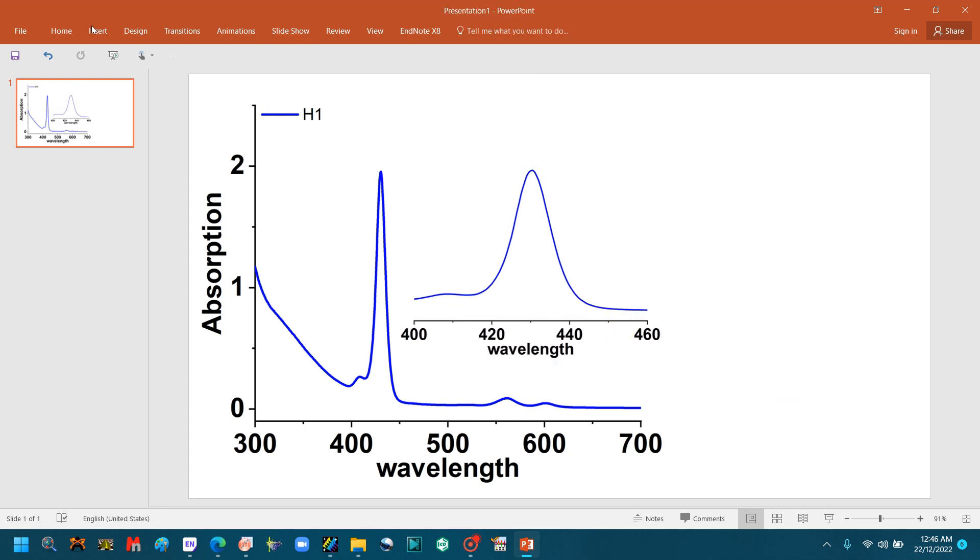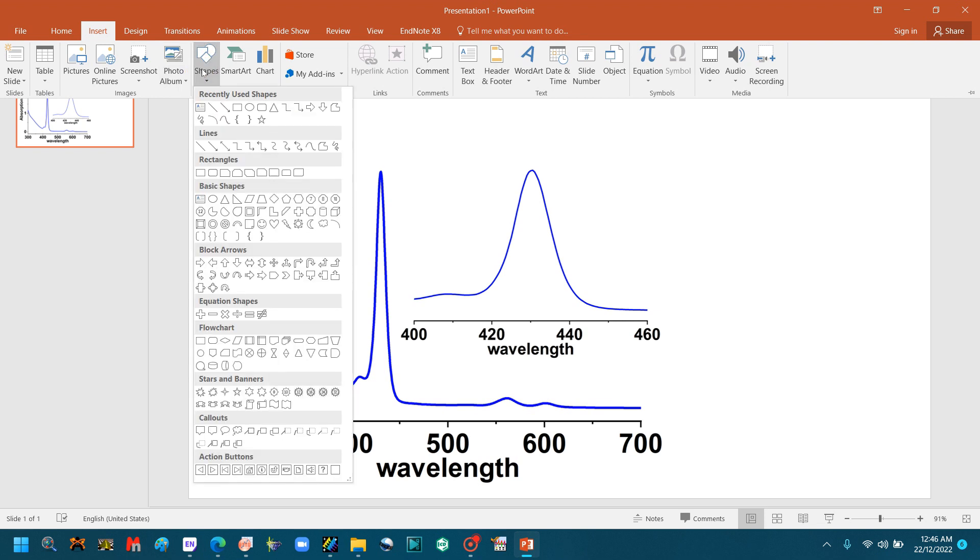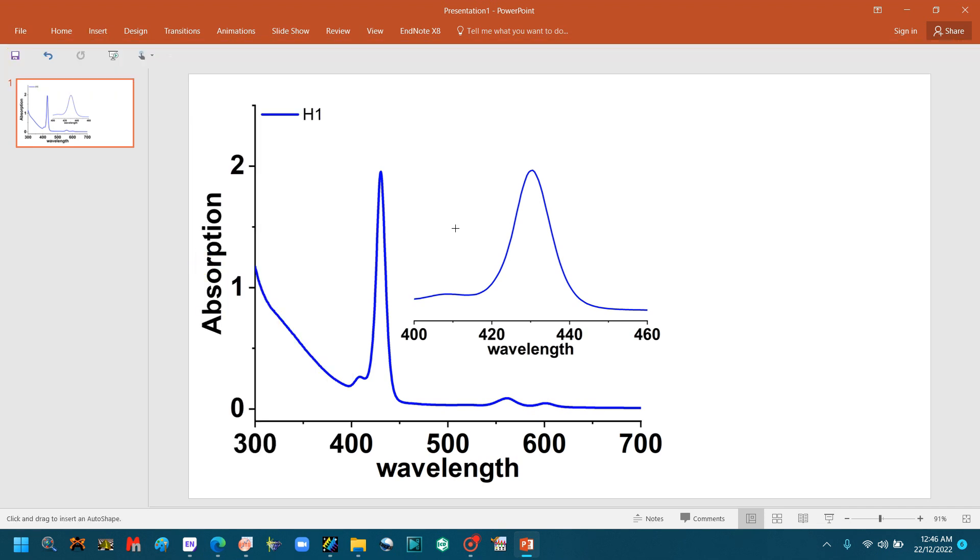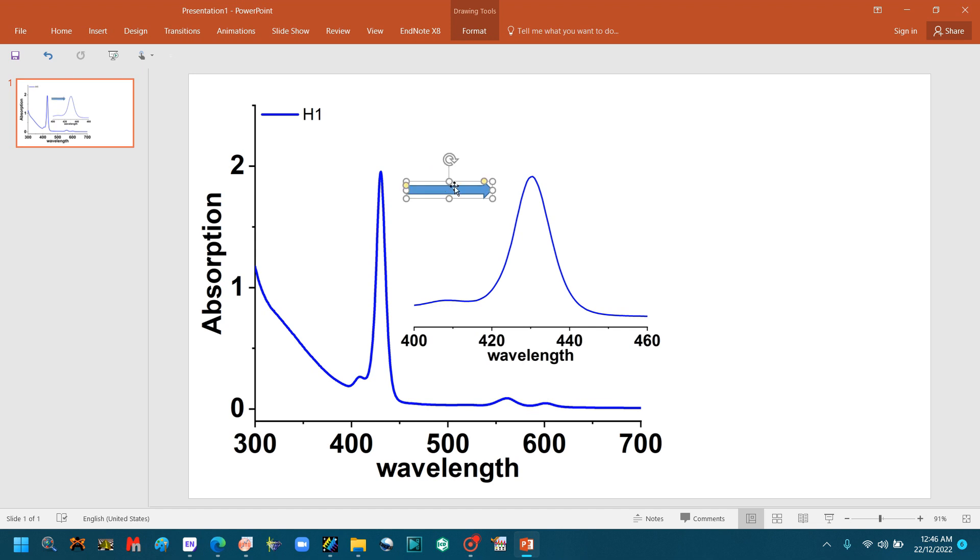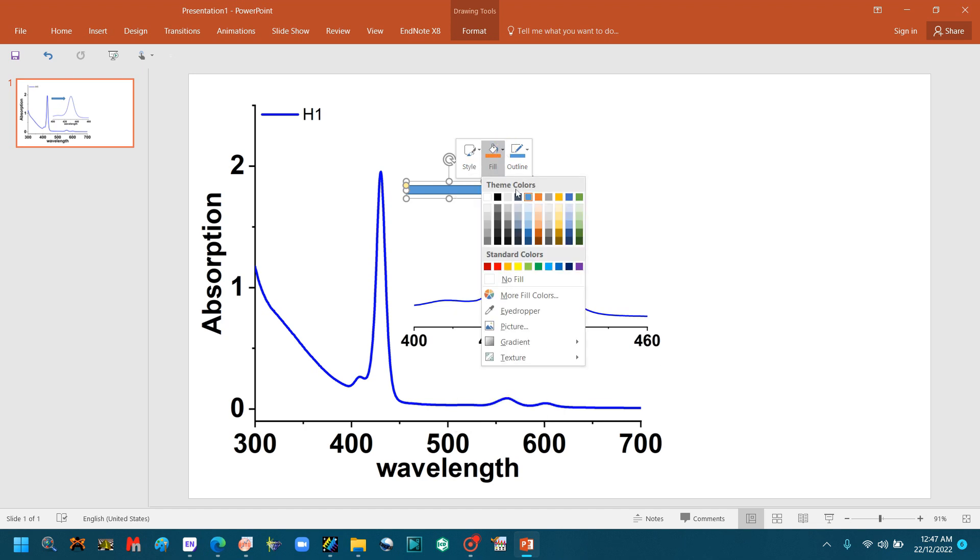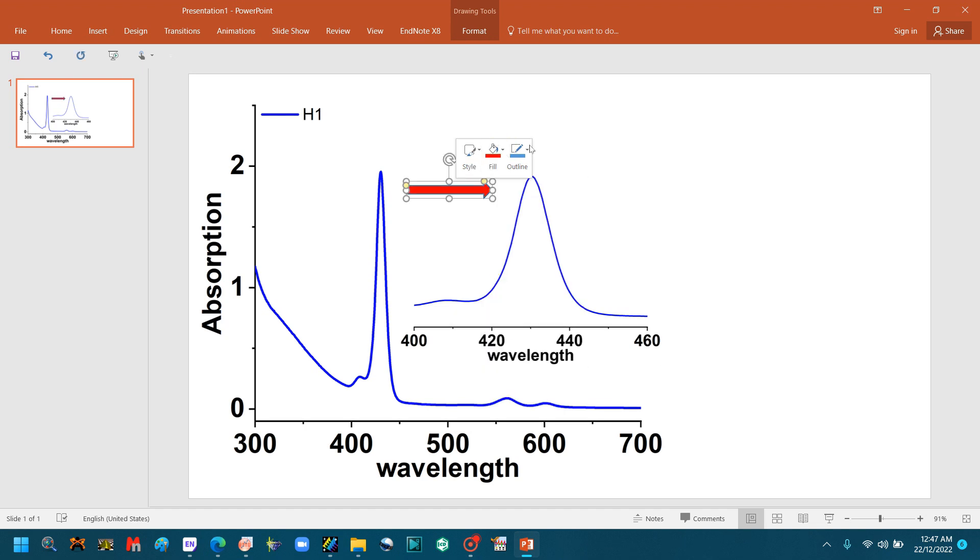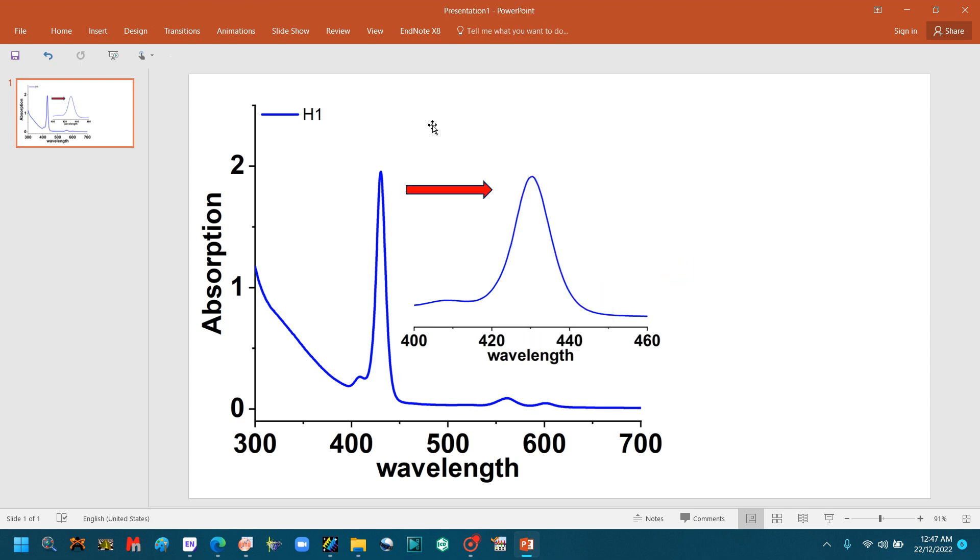You can go to Insert, go to Shapes, and make the graph look as beautiful as you can. You can use this arrow and connect it. You can change the color of this arrow. This is the fill. You can change the outline.